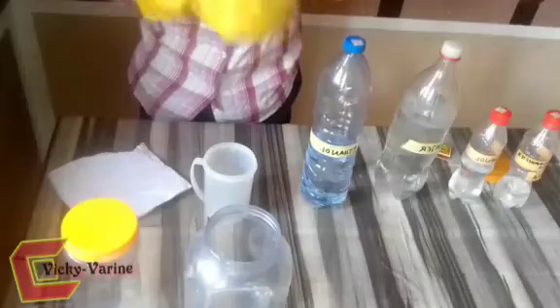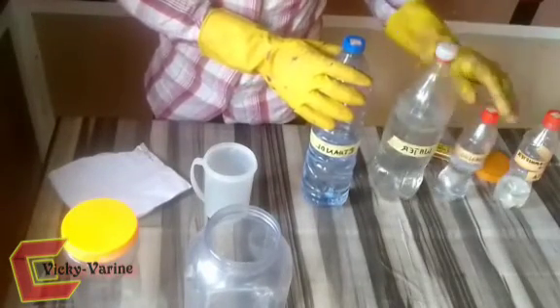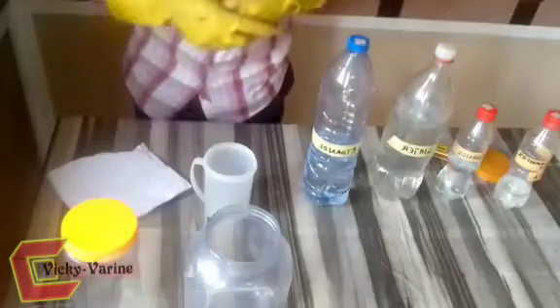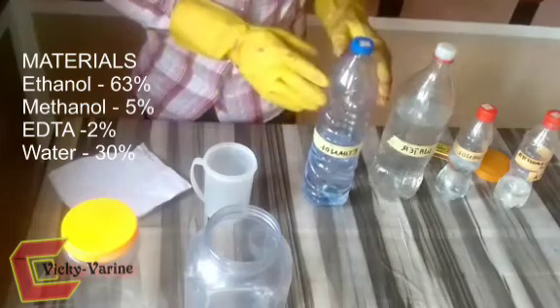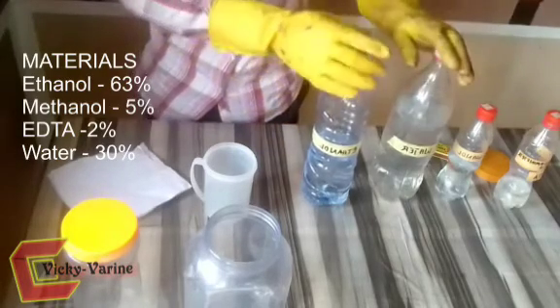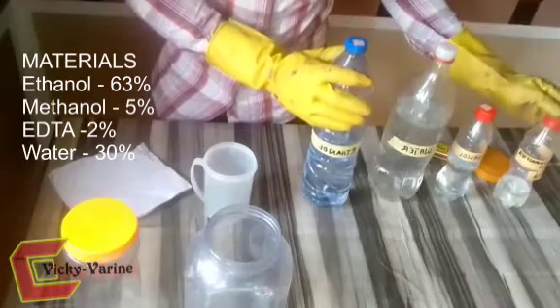We also have ethanol and methanol mixture, and many more. But today we will use ethanol, methanol, water, and EDTA — which is ethylenediaminetetraacetic acid mixture. So this is our ethanol, this is our water, this is methanol, and this is EDTA. You will take 63% of ethanol, 30% water, 5% methanol, and also 2% EDTA.